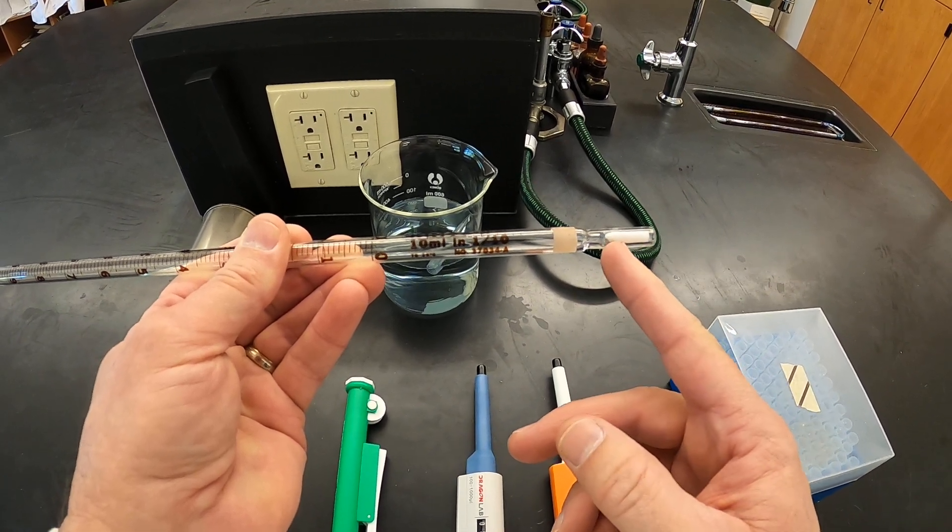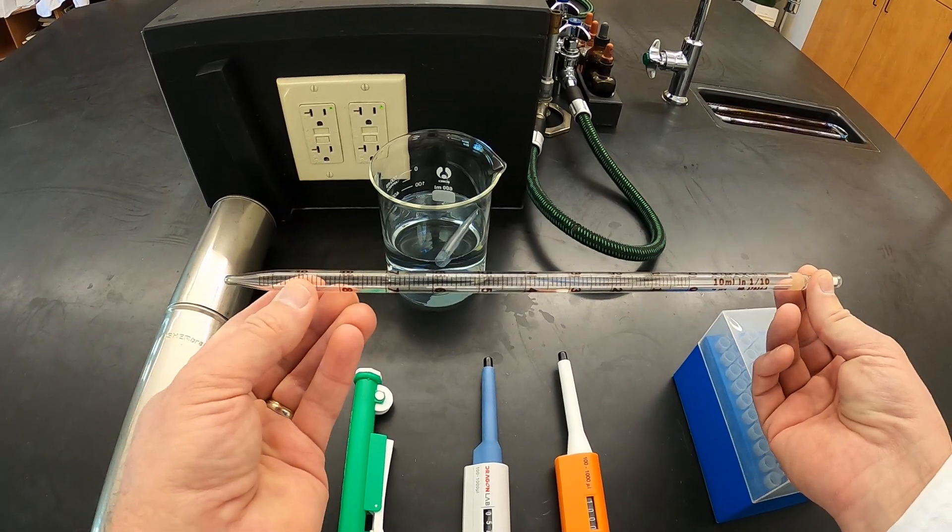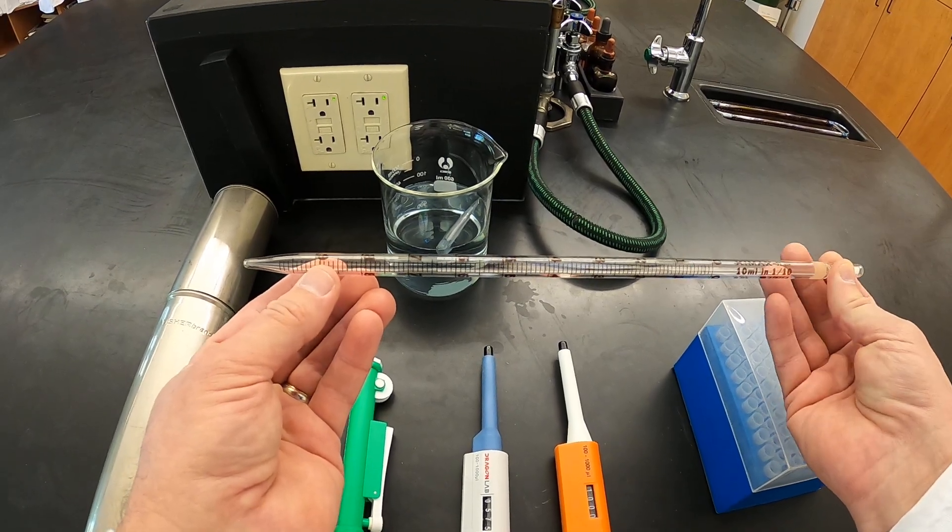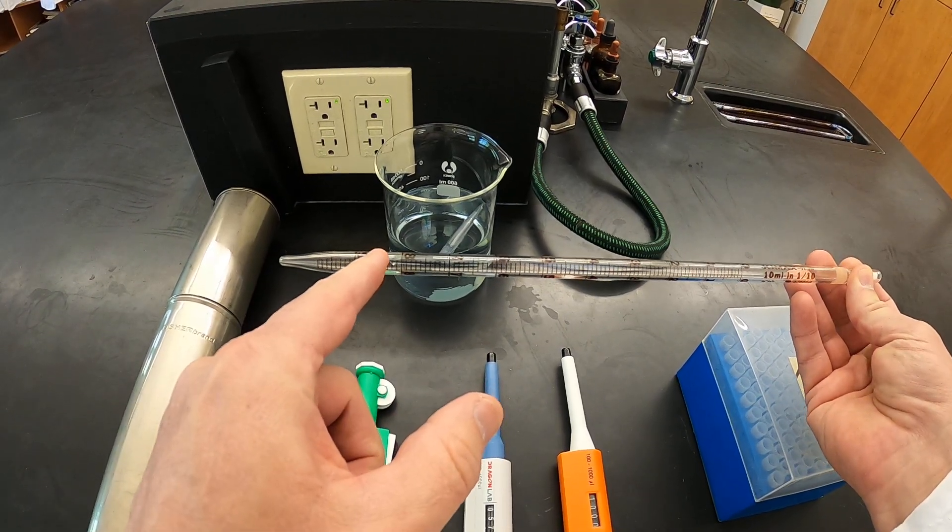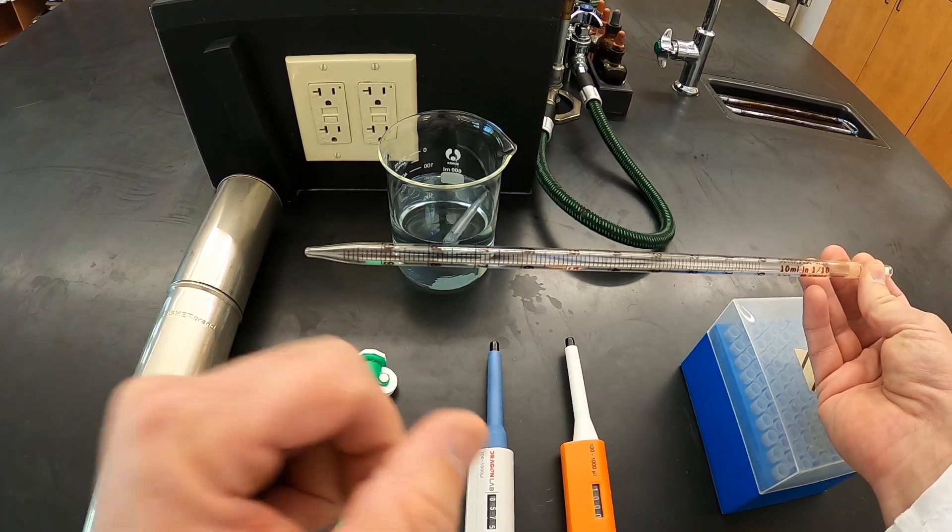The etched band here is an indicator that this particular pipette is what is called a serological pipette, or otherwise known as a blowout pipette, because in order to get the accurate volume we're blowing out all of the liquid all the way out of the pipette.